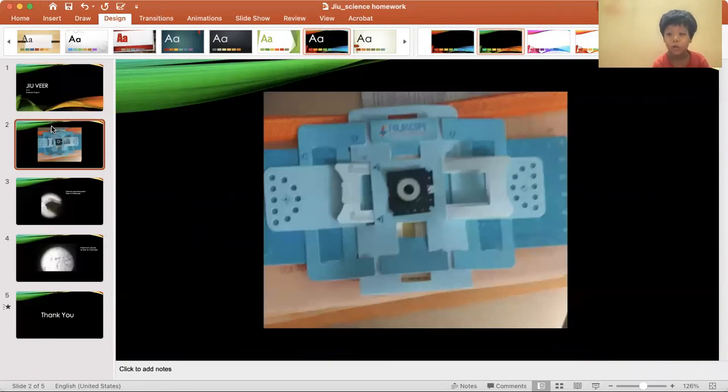This is a foldoscope. It's like a microscope, but it is made of paper and much, much cheaper.